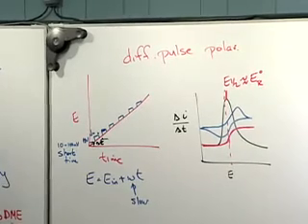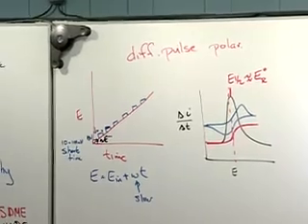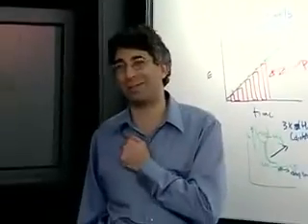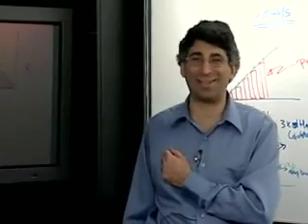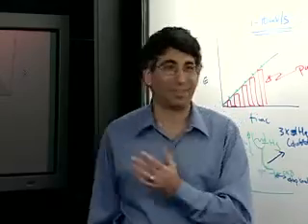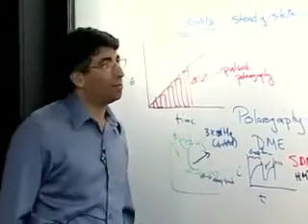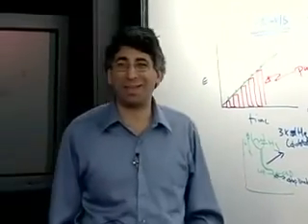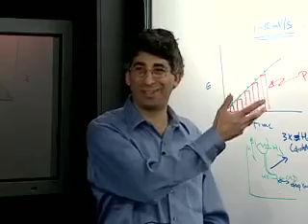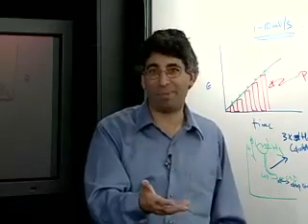There used to be a great advantage of one over the other. And by the way, I suppose I should add, there's another technique, perhaps the latest of the differential pulse techniques, that I totally ignored, which is so-called square wave voltammetry. Same idea, I use a square wave here. The big advantage used to be, in the day before computers, that you bought a machine and the various pulse sequences were hardwired into it. And so you used what you had built into your machine.